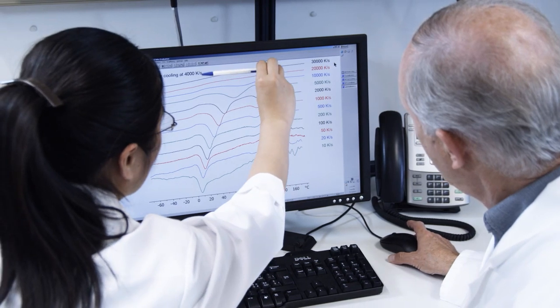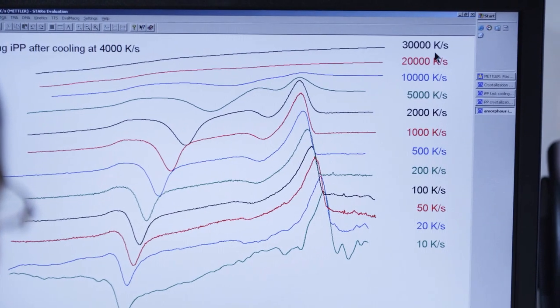Mettler Toledo's powerful Star software offers unrivalled flexibility and almost unlimited evaluation possibilities and allows you to explore a completely new world with Flash DSC.